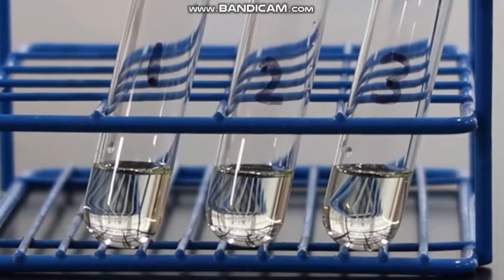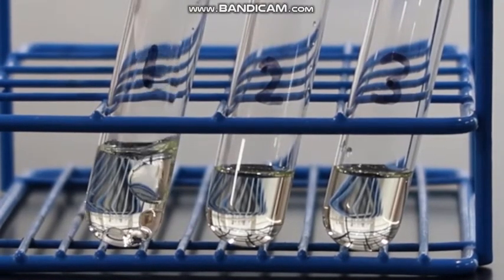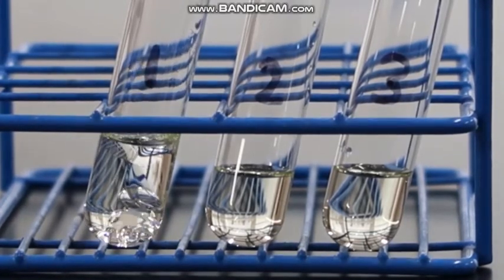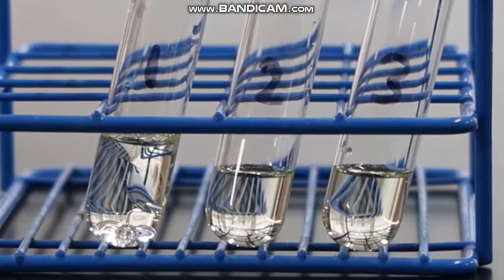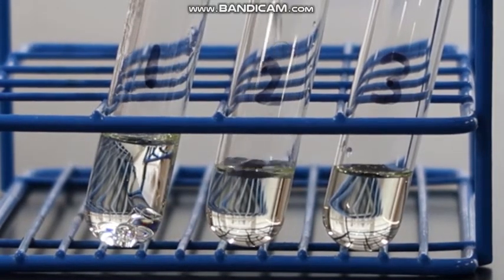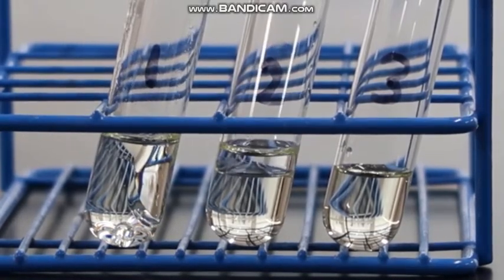Part B of this experiment has us exploring the properties of triacylglycerols, and each of these test tubes is a sample of vegetable oil. To test tube 1 is added a little bit of water, to test tube 2 is ethanol, and added to test tube 3 is hexanes.